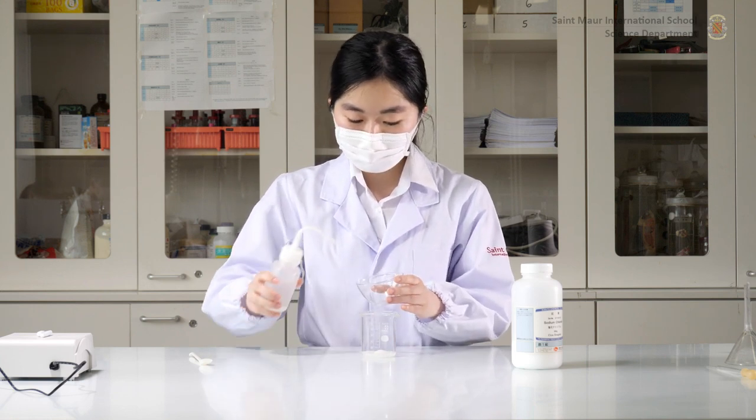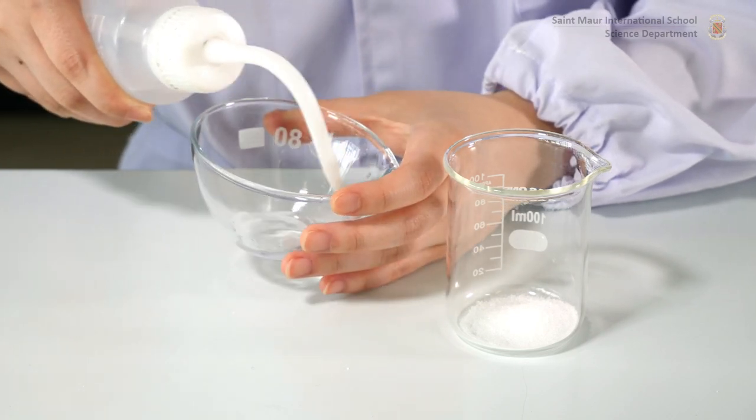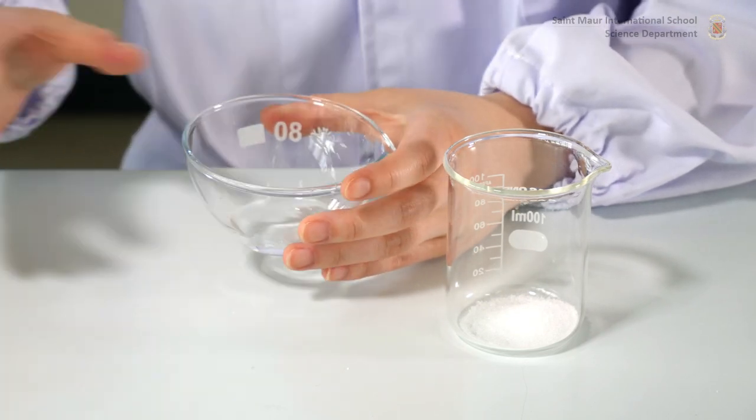Note that you should first dissolve the solute in a small amount of solvent in order to limit the uncertainties and losses associated with transferring undissolved materials.